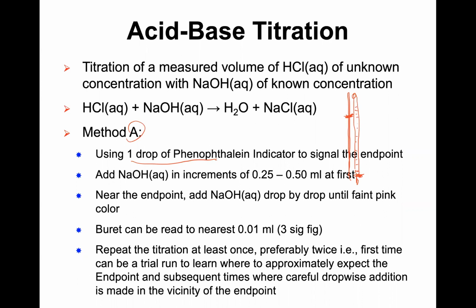And at the bottom, you have an Erlenmeyer flask. This will hold the hydrochloric acid we fill in, and we don't know its concentration. In the burette, we fill in sodium hydroxide, which we know the concentration.